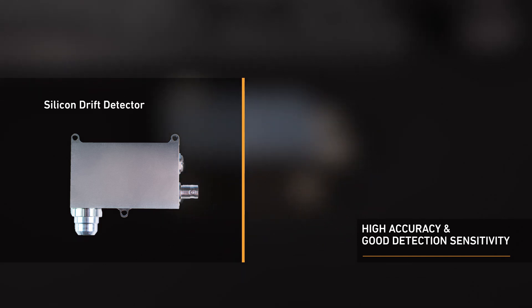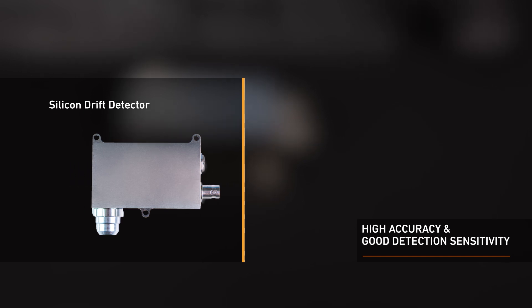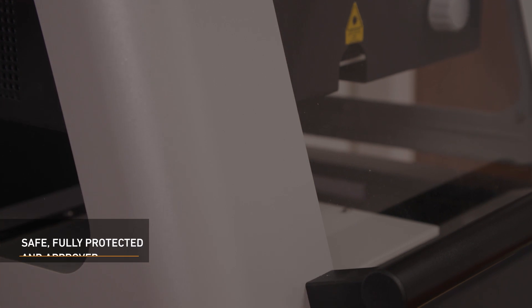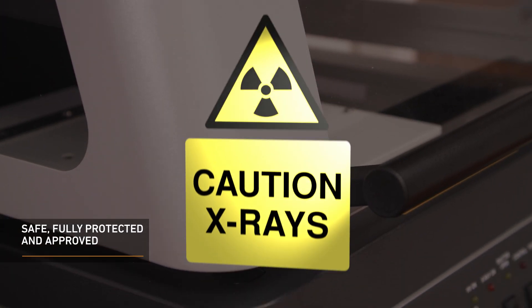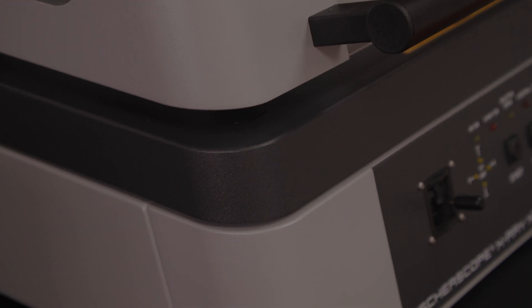These characteristics provide the best element resolution and measurement precision for material and very thin coating analysis. Safety is of the utmost importance to us and our customers. As such, the instrument is fully protected with type approval according to current radiation protection legislation.